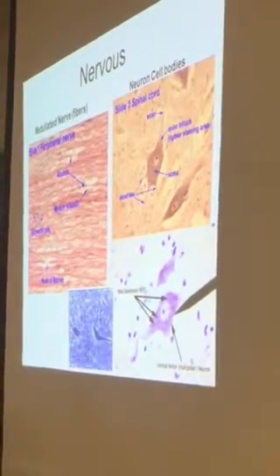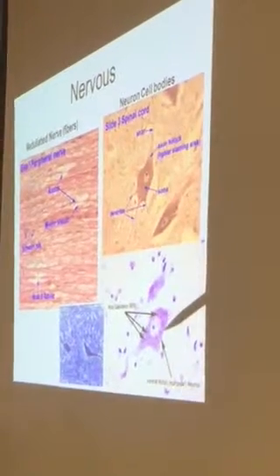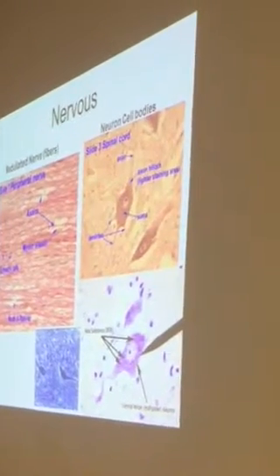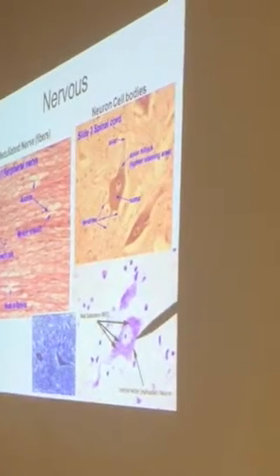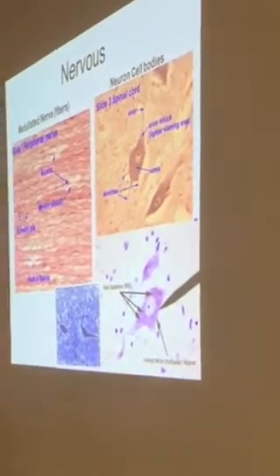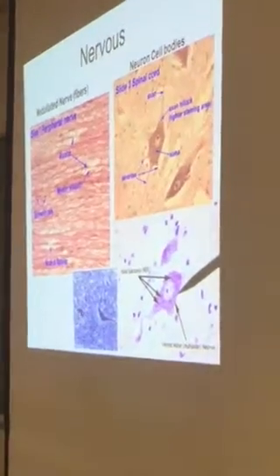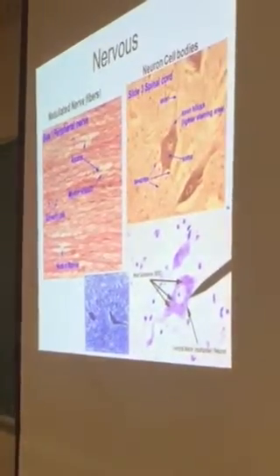What you do need to look at is the second slide, which says Nissl bodies. Nissl bodies will contain the cell bodies, which are these typical star-shaped cells. This is a really perfect example of a neuron cell body, but what you got are these things down here. All right? So, what you can see is that there is a nucleus. It's generally centrally located. But anything outside the nucleus, any little dot spot outside the nucleus, is a Nissl body.